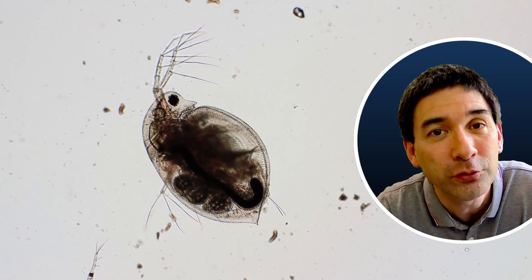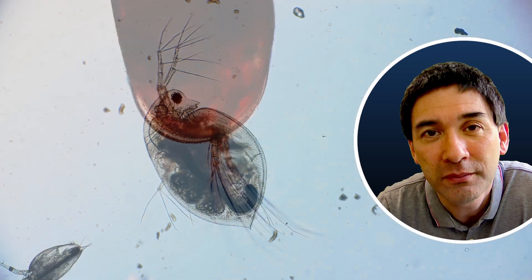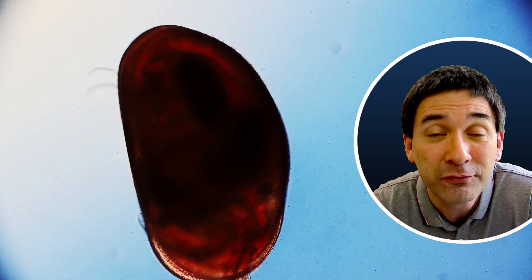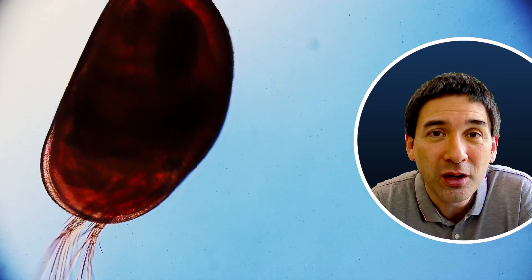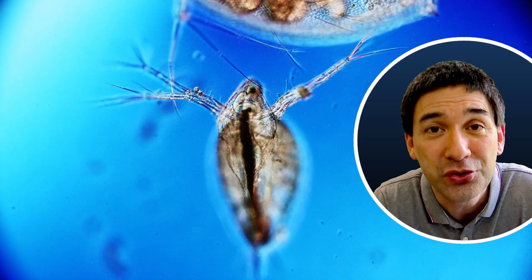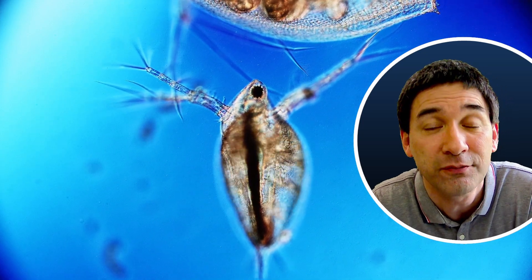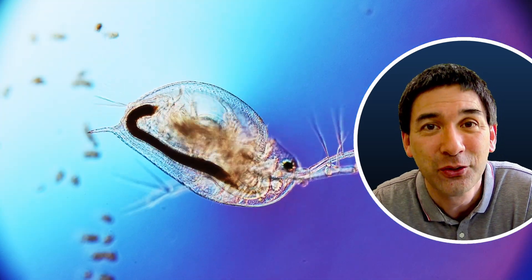When you put water crustaceans under the microscope, I recommend you do not put a cover glass on top, because this might crush the little animals. Simply put them in a small drop of water — the surface tension will prevent them from swimming away, though sometimes they do try to rotate around. These water crustaceans are quite important for keeping water clean: they feed on debris, decomposing material, bacteria, possibly protozoans like paramecia. I've also tried feeding them yeast cells — they like to eat those as well, and you can actually see them ingesting the cells before they poop everything out again.